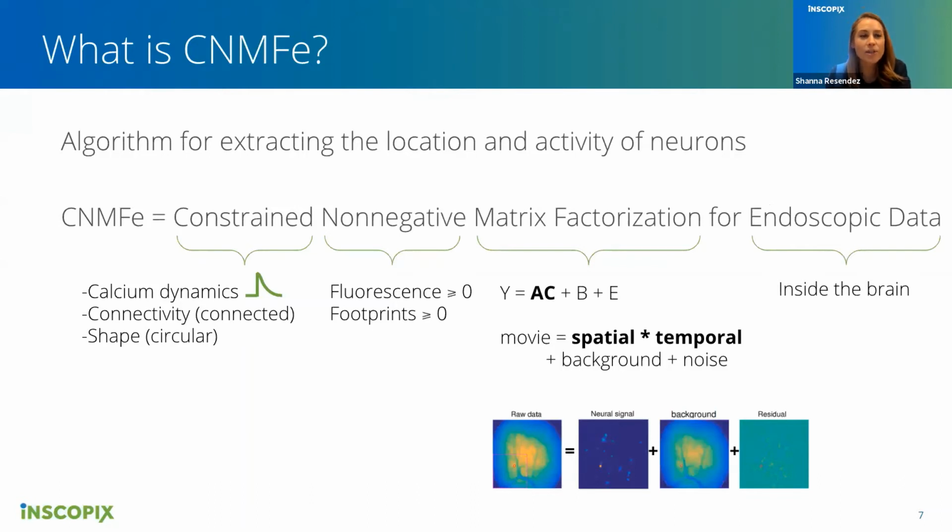And then my question is related to the comment you made about it being computationally expensive. Yesterday I was on a call with a customer and he gave some feedback that our computer spec recommendations for PCA/ICA and running it through IDPS are not great and they actually don't work well. So are we going to need to change that? And do we expect that with CNMFE to be even more computationally heavy, or does this parallel system you guys set up account for that?